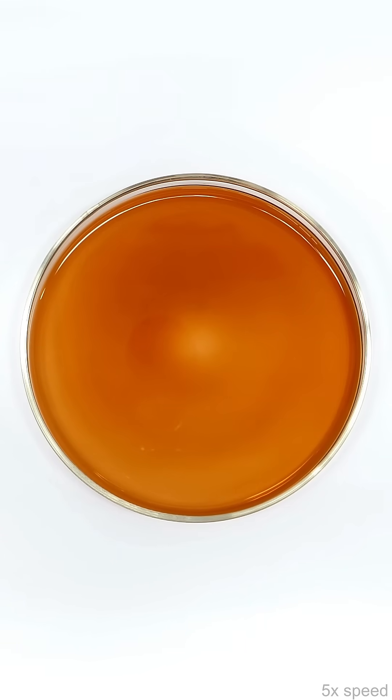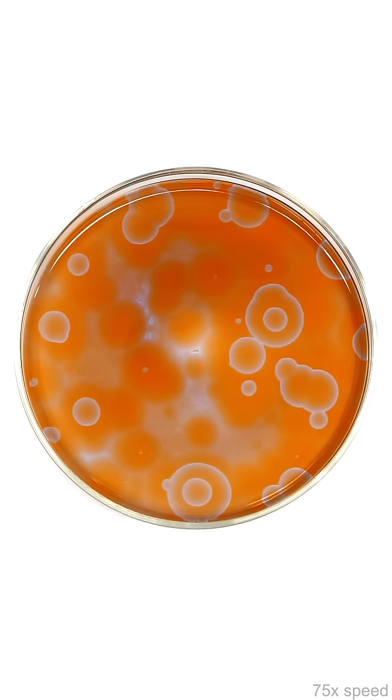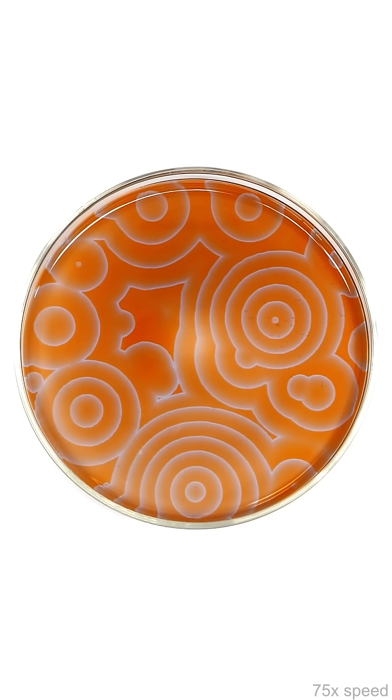At first, not very much was happening, but then I started seeing some small little spots appearing. Even more of them then started popping up, and they were all getting bigger and bigger. What's going on here is called a Belousov-Zhabotinsky reaction, and it's still one of the weirdest reactions I've ever seen.